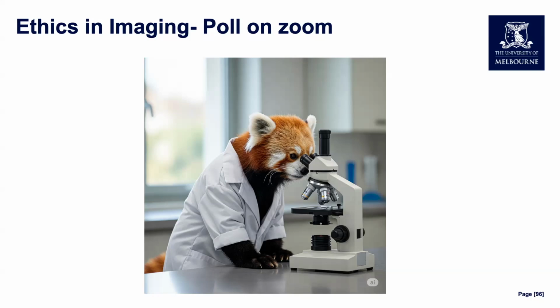So we can use the minimum intensity value on the histogram, which will clip out the kind of background. Ideally, the maximum intensity we can bring down again to rescale for visualization purposes. Those ideally are the two that we would use up until the point where we start to actually hit data, if you catch my meaning. I did also include gamma in there, although I'm not a huge fan of using gamma adjustments. But yeah, that is also possible. But again, you would have to say within the figure legend that that's what you've done.